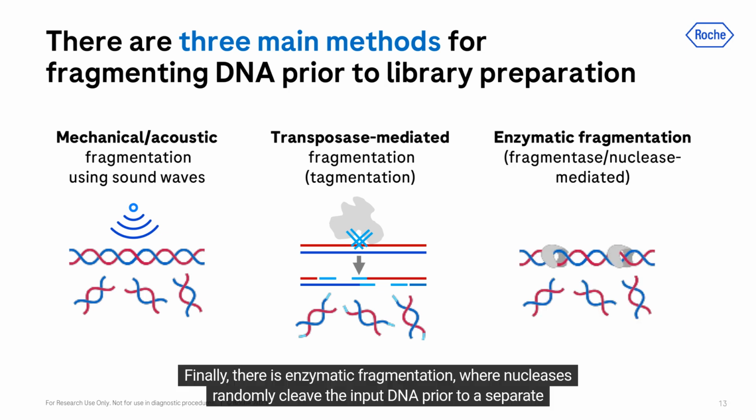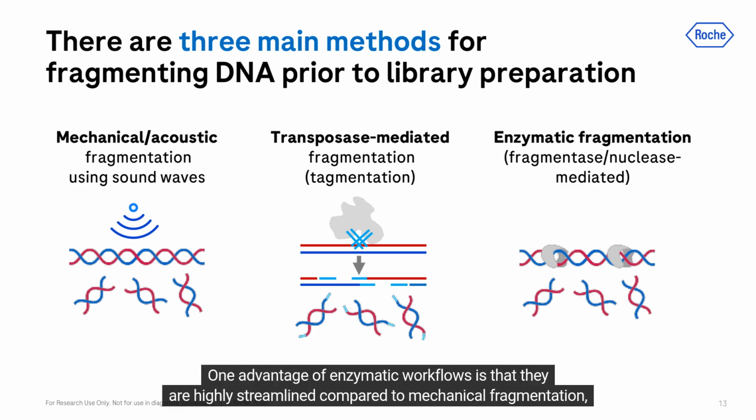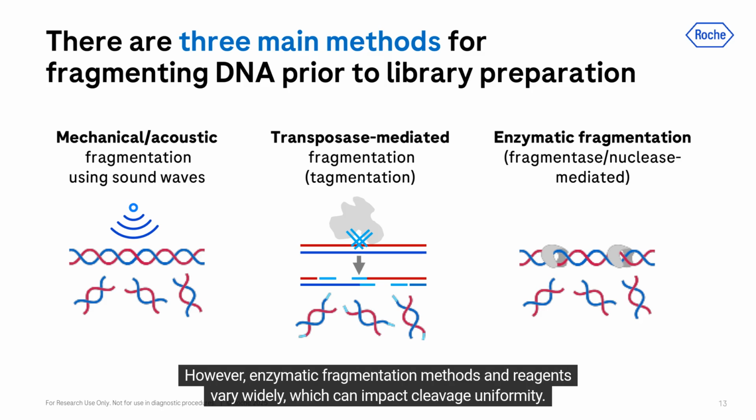Finally, there is enzymatic fragmentation, where nucleases randomly cleave the input DNA prior to a separate adapter ligation step. One advantage of enzymatic workflows is that they are highly streamlined compared to mechanical fragmentation and require less hands-on time compared to tagmentation. However, enzymatic fragmentation methods and reagents vary widely, which can impact cleavage uniformity.